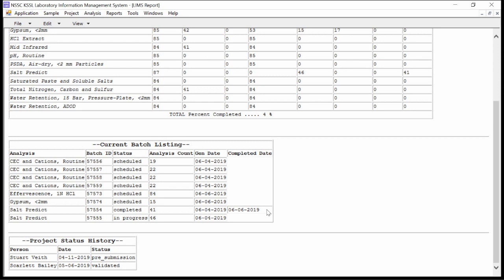Is that correct, Rick? I don't remember. That's the latest one. It's the latest one on this report. Yeah, it's the latest. If you put in a sample number and click find batch, it'll give you both completed dates for that. So I think it's the most recent completed date that appears on this screen.